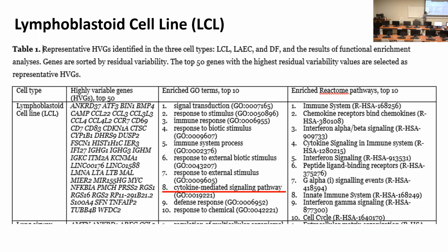Overall, we have an impression that this is an immune cell. It's not specific, but in a large ballpark, it's immune cells. So you ought not to mix this up with skin cells. We'll see.